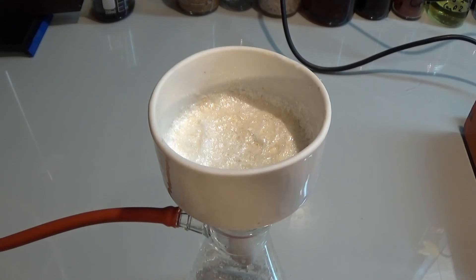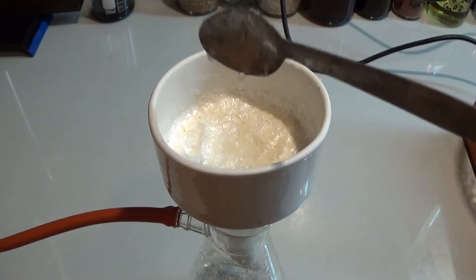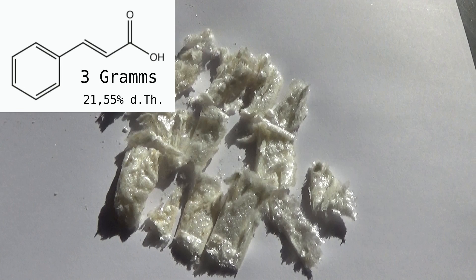So well then, I got 3 grams of impure product which corresponds to a 21.55% yield. That's bad, but most certainly a whole lot of product got stuck with the sodium carbonate. Have fun and do not kill yourself.